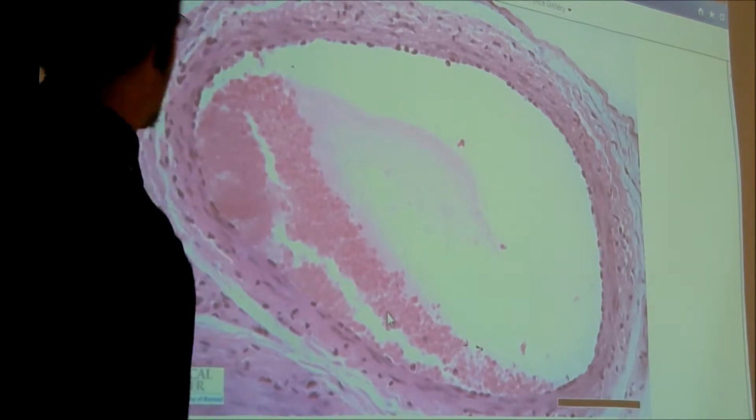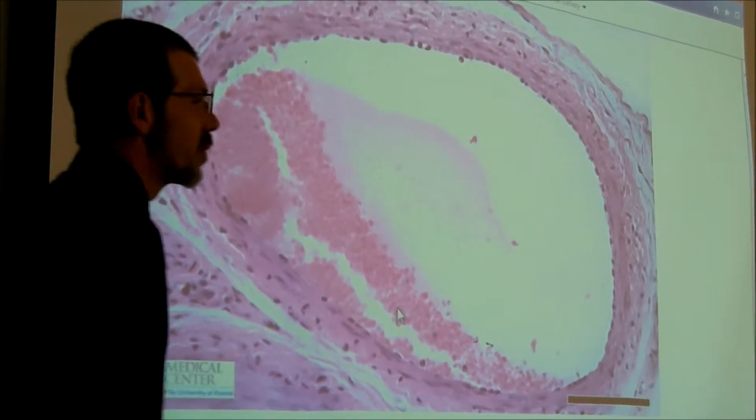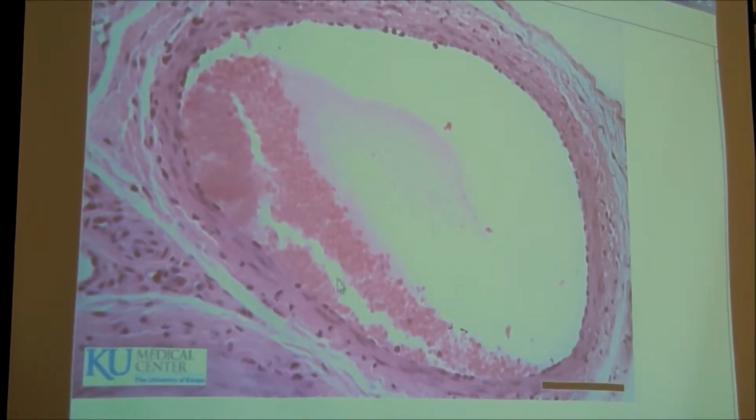Who knows, right? These are blood cells that are clotted up over here. I don't know what, some stain, goop, that's a good science word. So is this an unhealthy vein? That's okay. I don't know. So let's try this one.